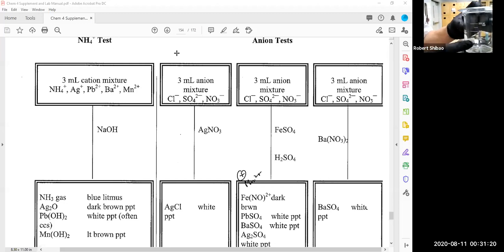Okay, then we need a way to capture the gas and test the gas that's coming off this. And so I got my watch glass. There's some stuff on this one. It wasn't cleaned so well. And I have my red litmus. Bases turn litmus blue. Bases are blue. Acids turn litmus red. And so red should turn blue. Blue should stay blue.